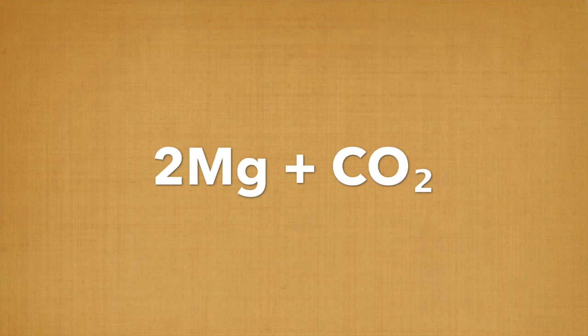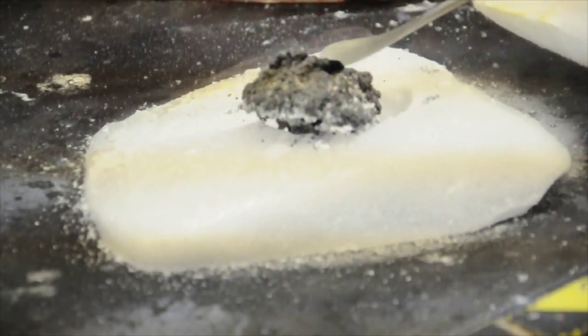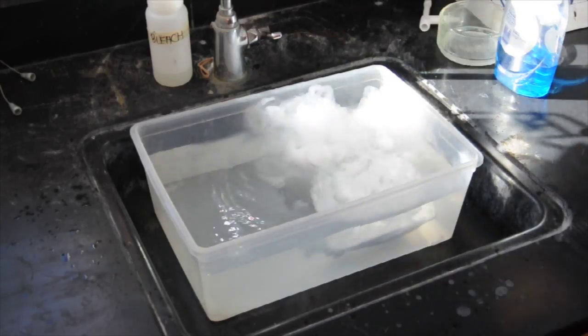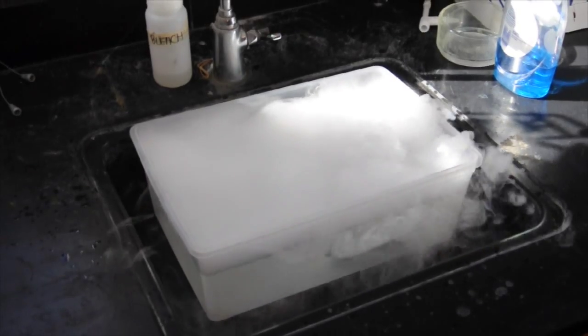The magnesium and carbon dioxide burn together to create magnesium oxide. The remaining carbon is separated and can be seen as a black coating on the outside of the magnesium oxide. Here we can see the carbon dioxide being released from the dry ice — the CO₂ is the white gas floating on top of the sink.